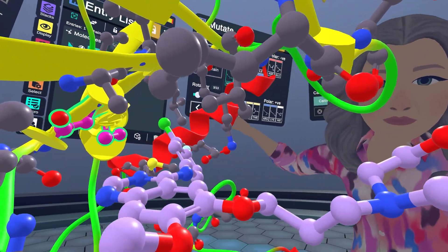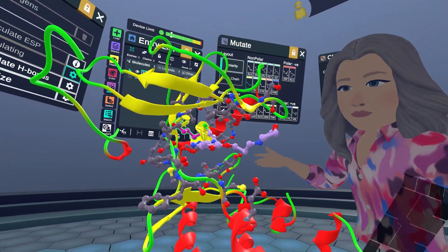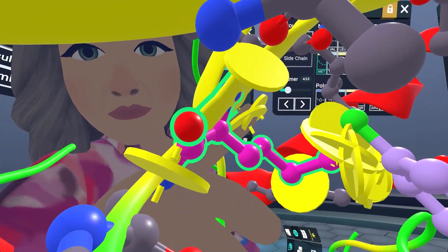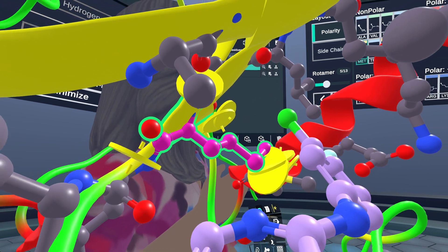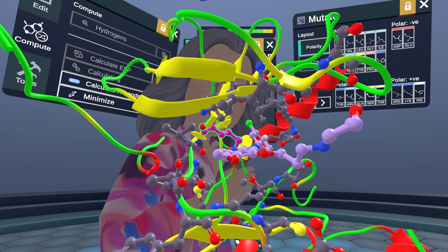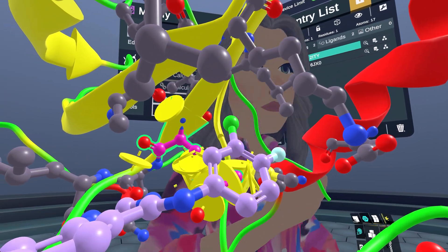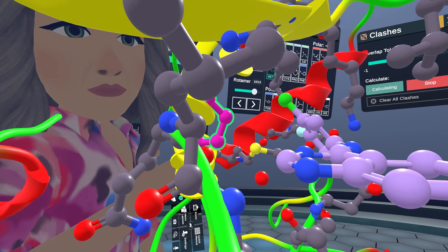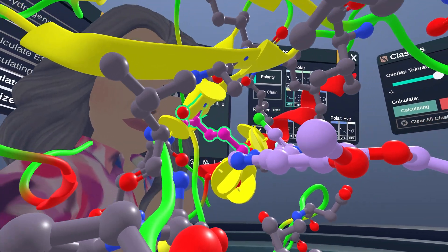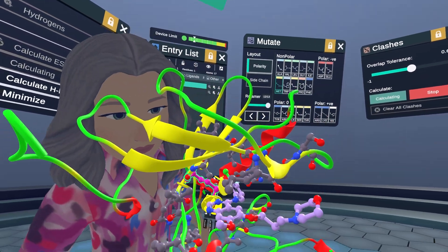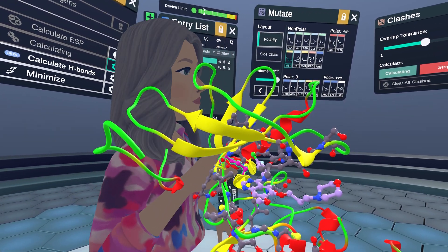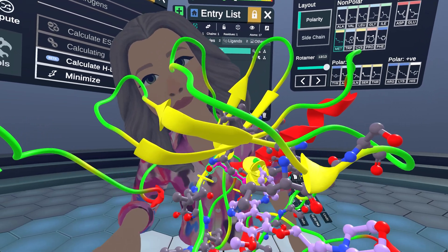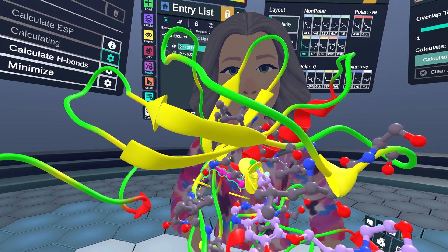The first few rotamers show nothing happening with the gefitinib. When we get to the fourth one, we do see a bunch of clashes with the inhibitor and also with the protein. As I scroll through, we can see when there are not clashes with the inhibitor. At rotamers 12 and 13 we start to really pick up significant clashes with the gefitinib, and rotamer 13 looks like it would cause the most problems for inhibitor binding in its preferred mode.